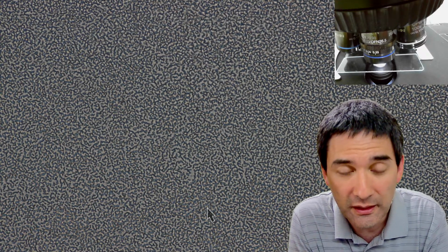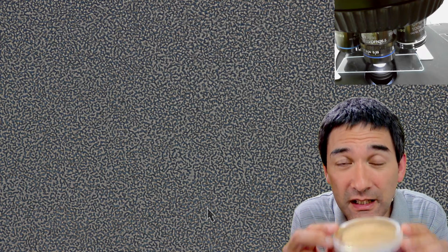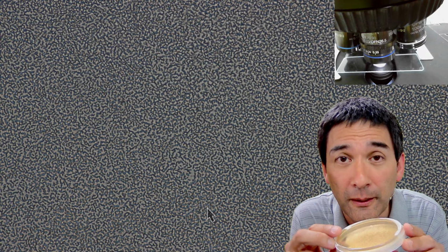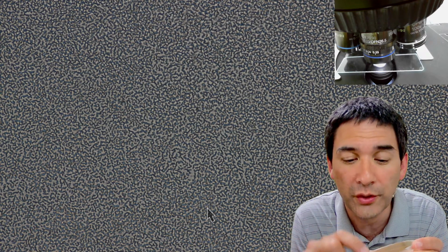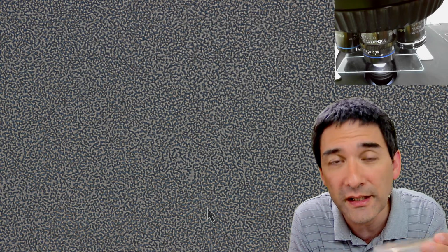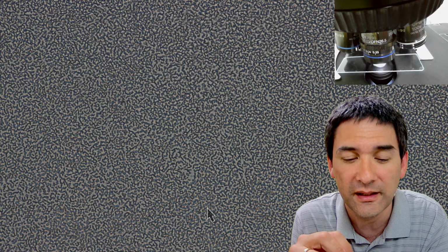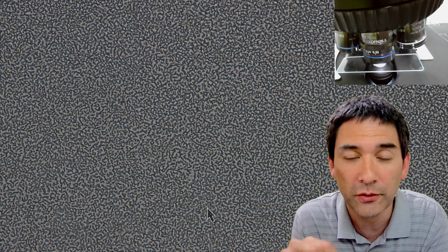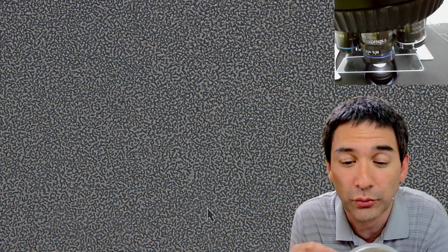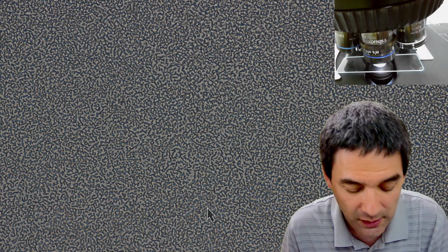The thing is the following. Is it possible to also grow dangerous stuff on these plates? Yes, especially if you've got contaminants on it. When you don't do this properly and you've got a colony growing somewhere, you don't know which bacterium it is, and the number of bacteria, as you can see here in the background, is astronomically high. So even if you are using safe bacteria, if you don't work hygienically, there is of course the possibility that you end up growing bacteria where you don't know what it is. So I'd be careful even here.